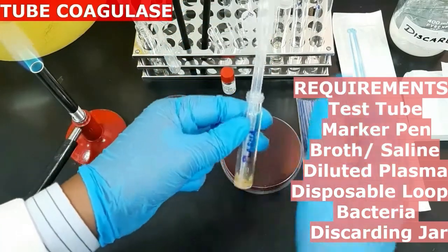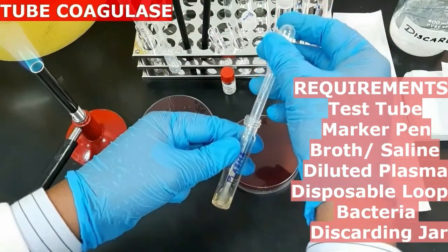Then add 0.5 ml of diluted plasma to each tube and mix it.